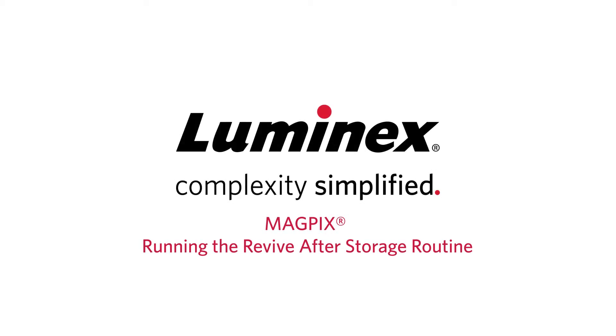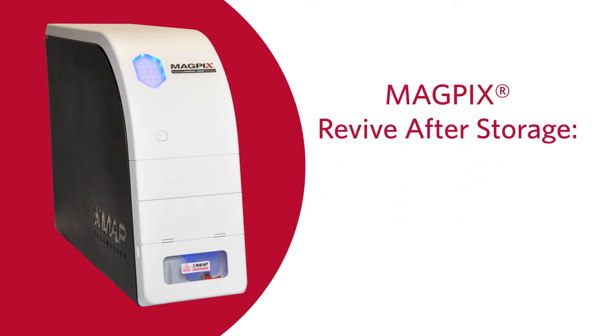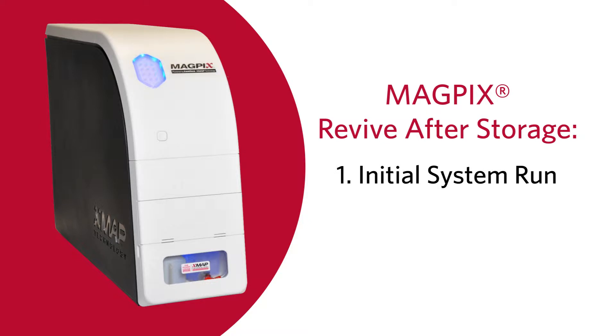Let's learn how to run the Revive After Storage routine on the MagPix. The Revive After Storage routine is necessary when the MagPix system runs for the first time and is recommended when the system has been idle for more than a week.